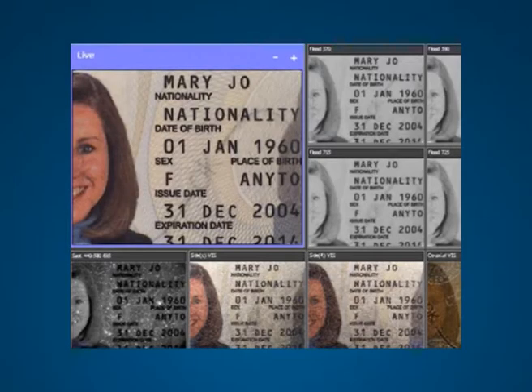VSC works with the live image. This live image can be saved and again compared with another live image. VSC has an auto exposure which automatically controls the iris opening. The operator can control focus, magnification and zoom. Side by side comparison, spotlight view and transmitted light examination may also be carried out successfully.